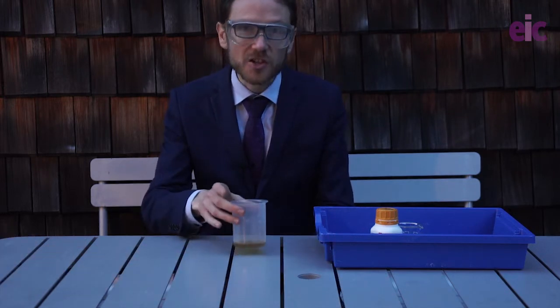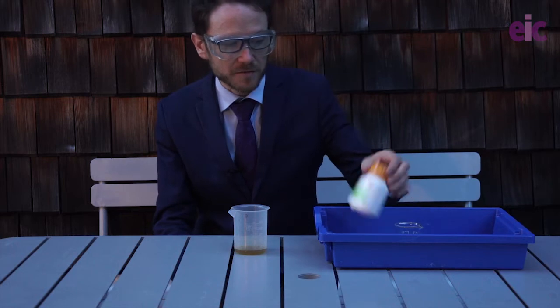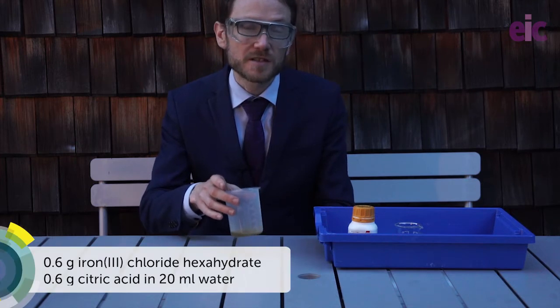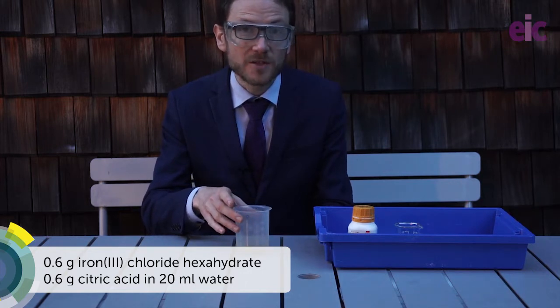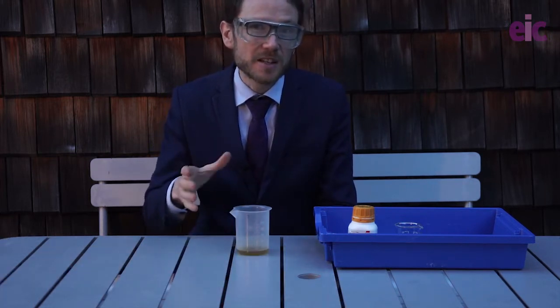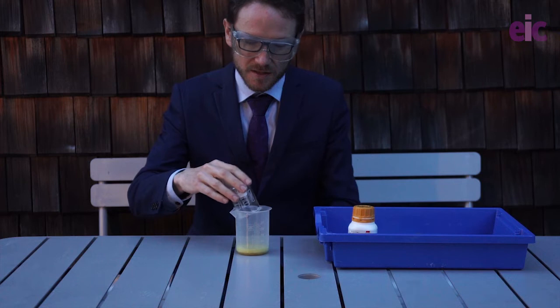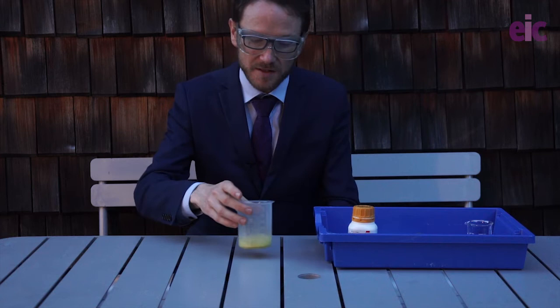So the Herschel cyanotype mixture basically requires a mixture of citrate and iron(III) ions in the presence of some potassium hexacyanoferrate(III). What I have here is 20 ml of water into which I've dissolved 0.6 grams of citric acid and 0.6 grams of iron(III) chloride hexahydrate. It's important to use the hydrated form of this. The citric acid we're then going to neutralize with some ammonium carbonate, and at this small scale you can actually go and add a decent amount of this all together.